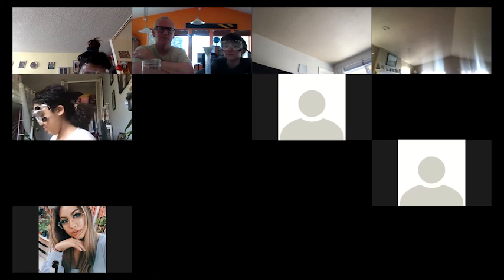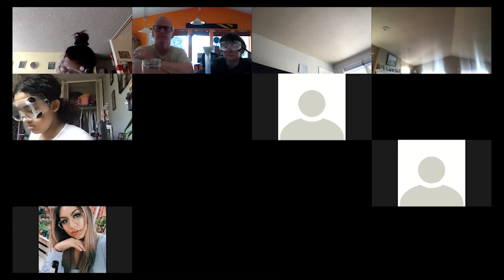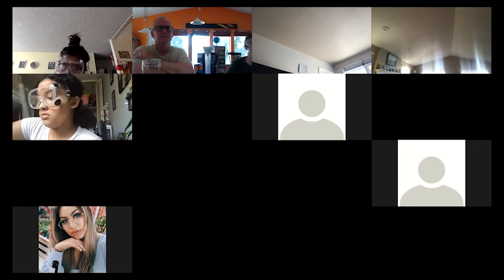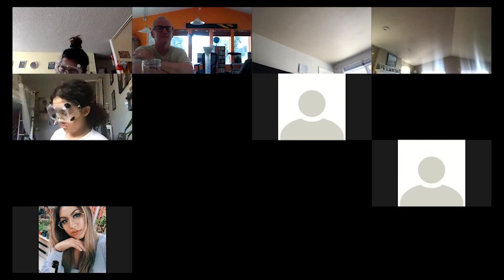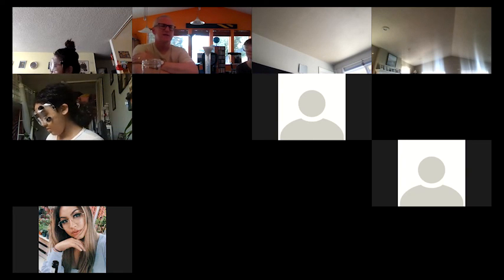So can anyone explain why the color changed from blue to brown? What happened to the copper? When it was blue, it was one thing, and now that it's brown, it's another thing.